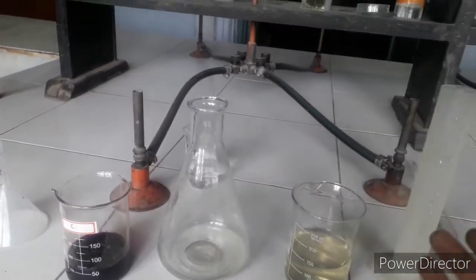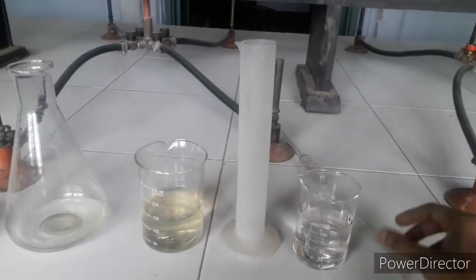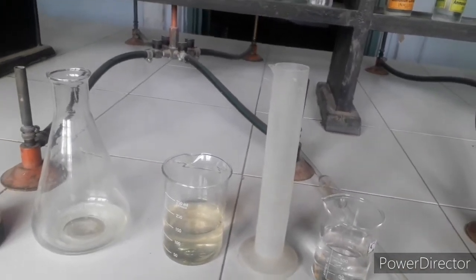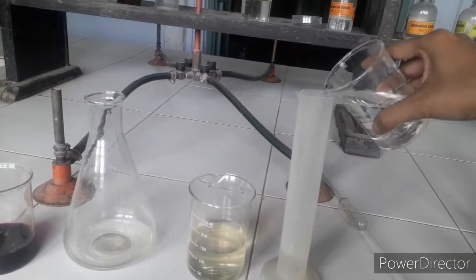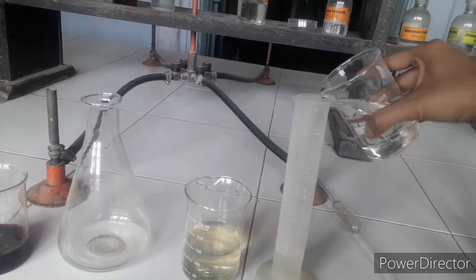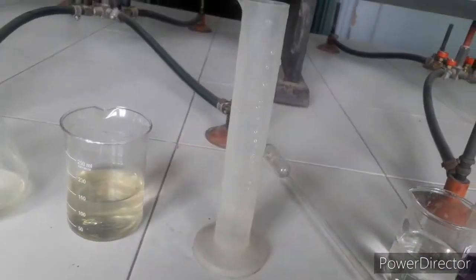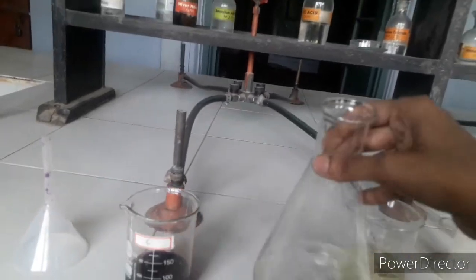The next step is to take the measuring cylinder and measure out dilute sulfuric acid, which will be provided by your school or teacher. Check the question paper for how much to take — 20 ml or 25 ml, as procedures may differ. I am using 20 ml. Now pour this 20 ml of dilute sulfuric acid into the conical flask and mix it. Then place the conical flask below the burette.